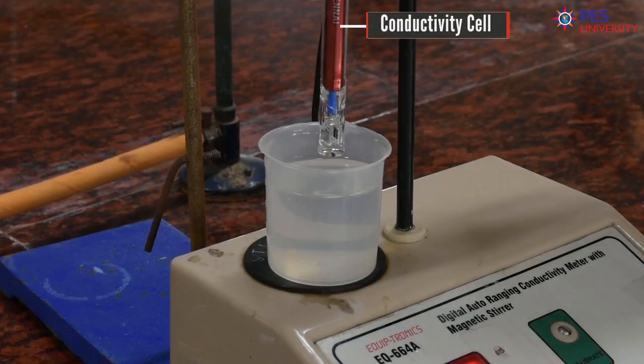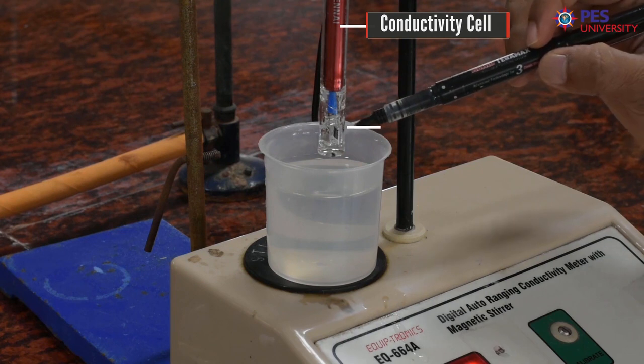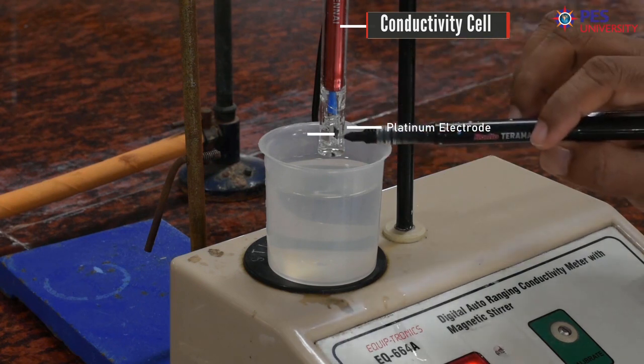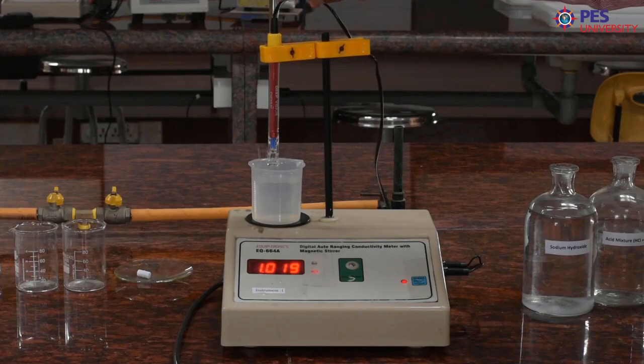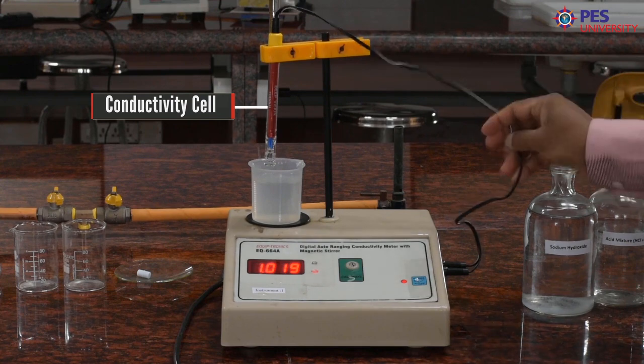This is the conductivity cell which has two platinum electrodes. This is one platinum electrode and this is another platinum electrode. This conductivity cell is connected to the conductometer like this.